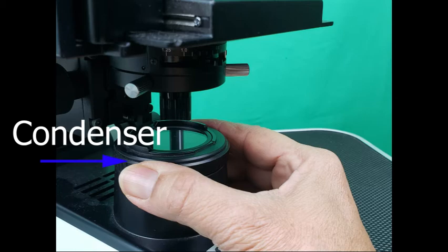Condenser: Located just below the stage, it aligns the light beam through an opening in the stage and through the specimen. In many microscopes, the condenser includes a knob that raises and lowers the condenser to control light intensity.